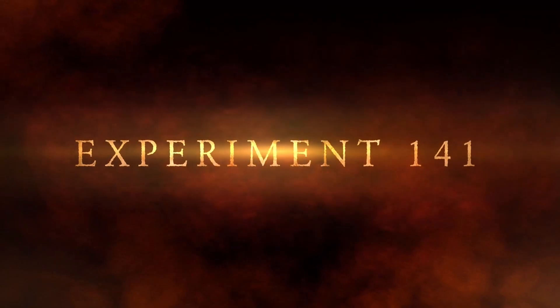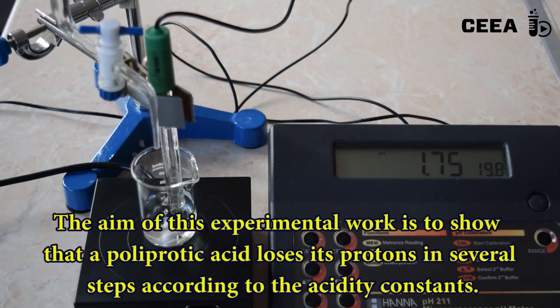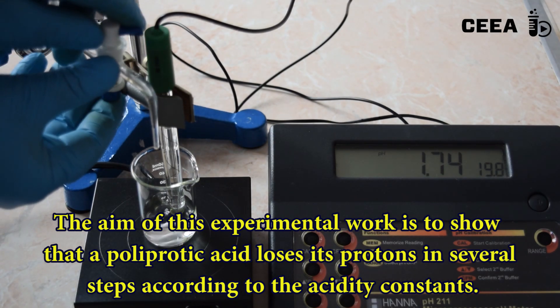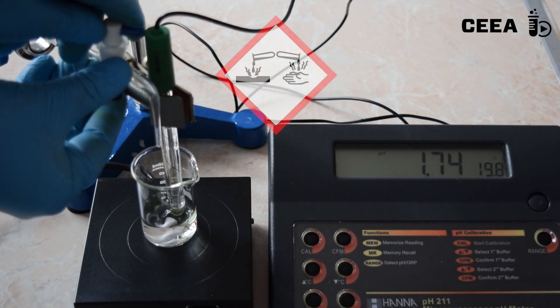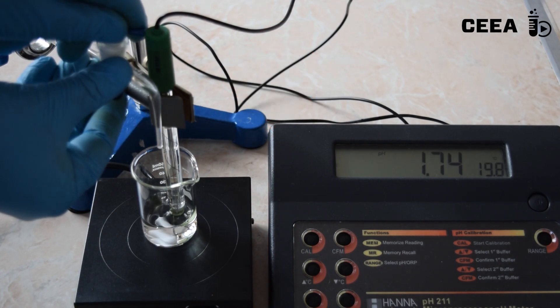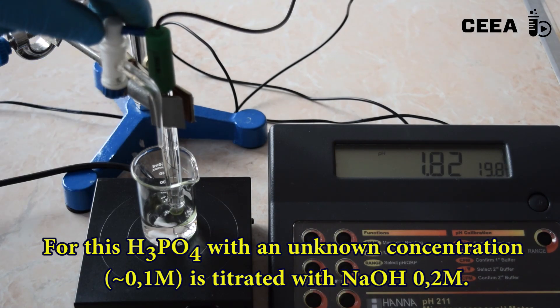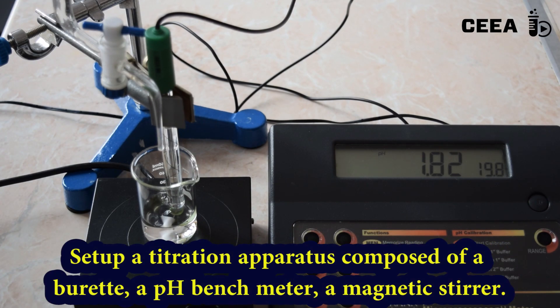Titration of phosphoric acid with alkaline bases. Phosphoric acid is a tribasic acid which can be neutralized with alkaline bases during a titration process. Measuring the pH against the added volume of base, we observe that the acid loses its protons in steps. The experimental titration setup uses a 0.1 molar phosphoric acid to be titrated with 0.2 molar sodium hydroxide.